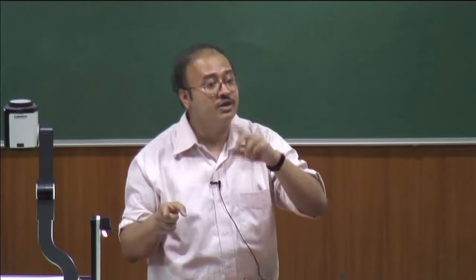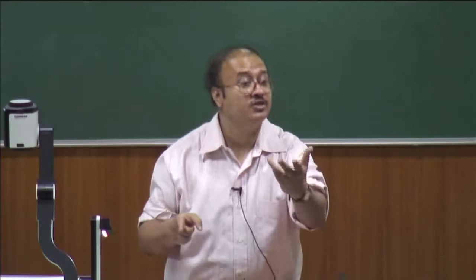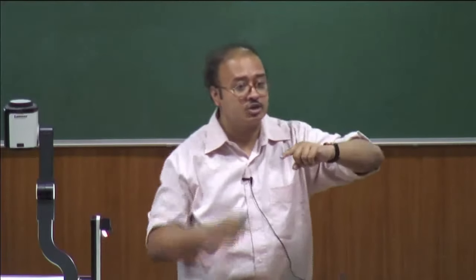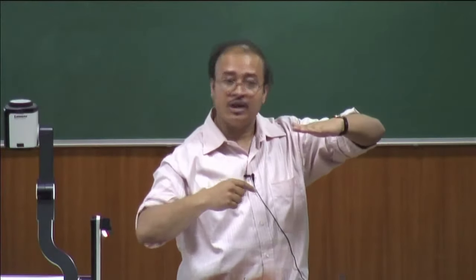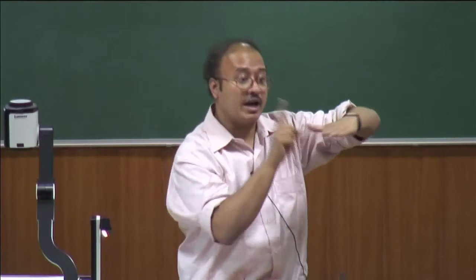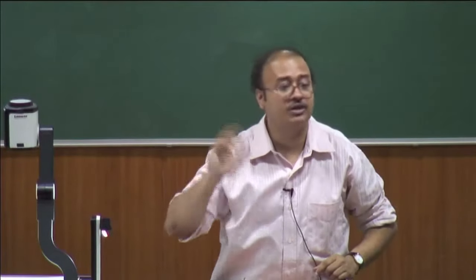So, whatever decrease or increase you would be having would not be related to the sample, but would actually be an artifact of what? The light that you sent through. So, then what you do is this reference photomultiplier, you know what it does? What it does is it always normalizes with respect to your beam that is coming in. So, you take your actual sample and you divide it by the reference photomultiplier intensity. That means, that one actually normalizes whatever intensity you have, and you get the corrected fluorescence spectrum.